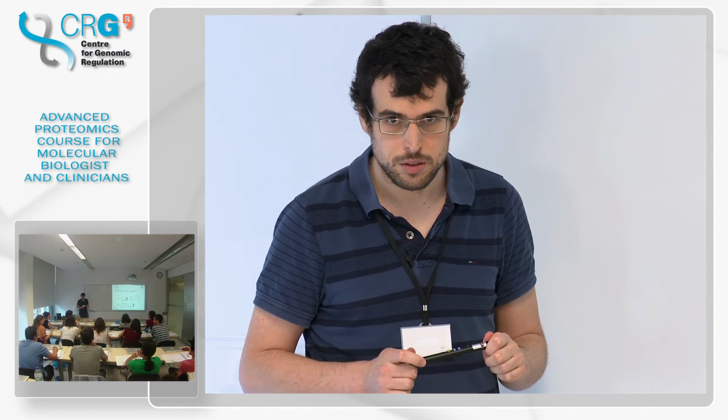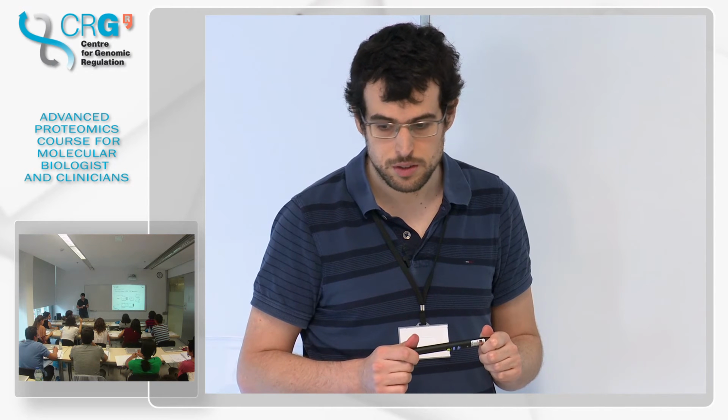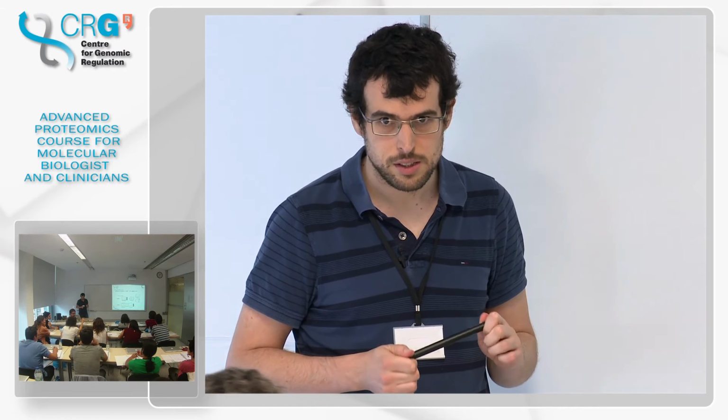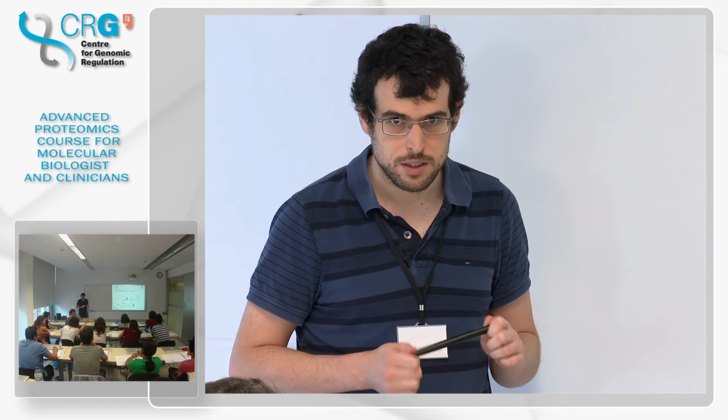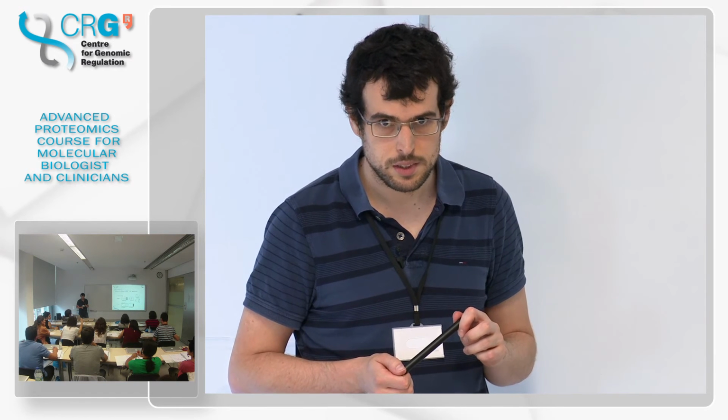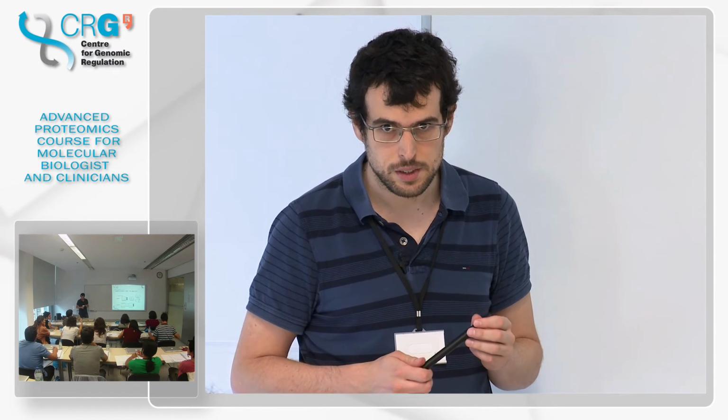When you talk about a cycle, maybe there's one introduction of the sample into the mass spectrometer, but then you can do more than one cycle with the same sample, with the same electrospray, or does it mean another electrospray?